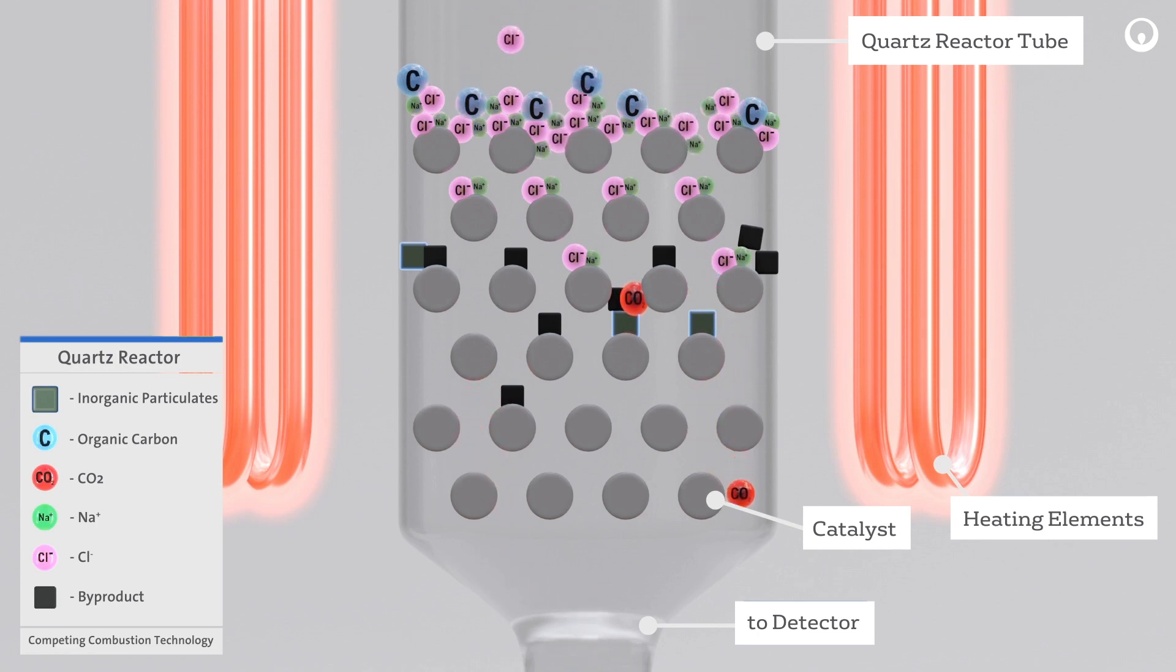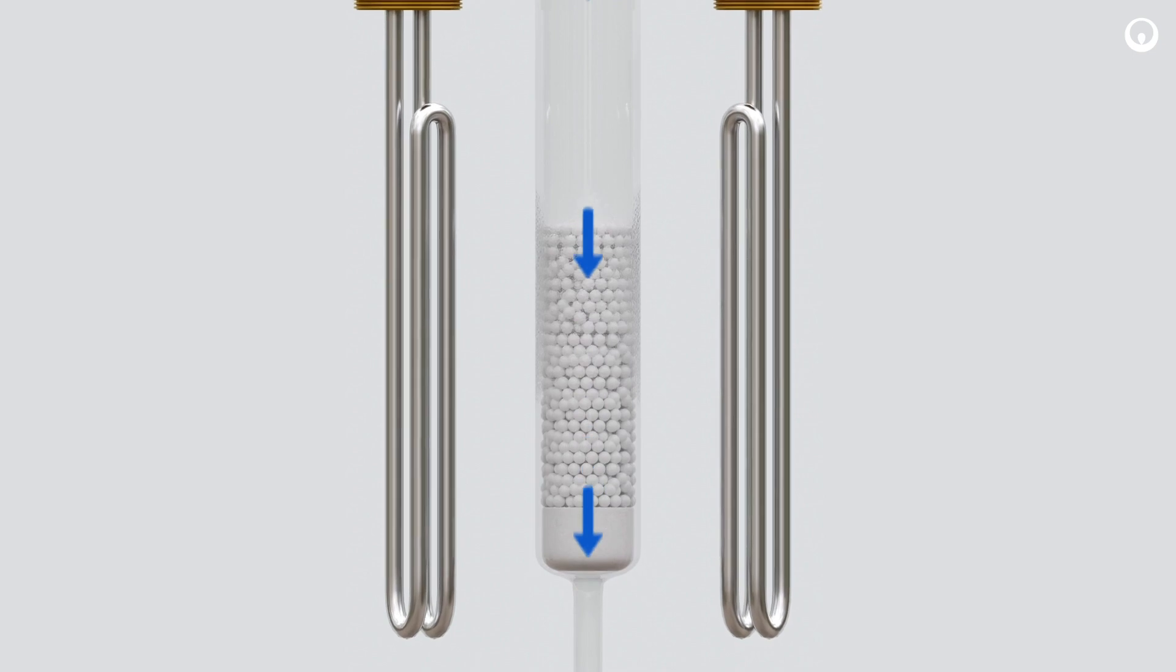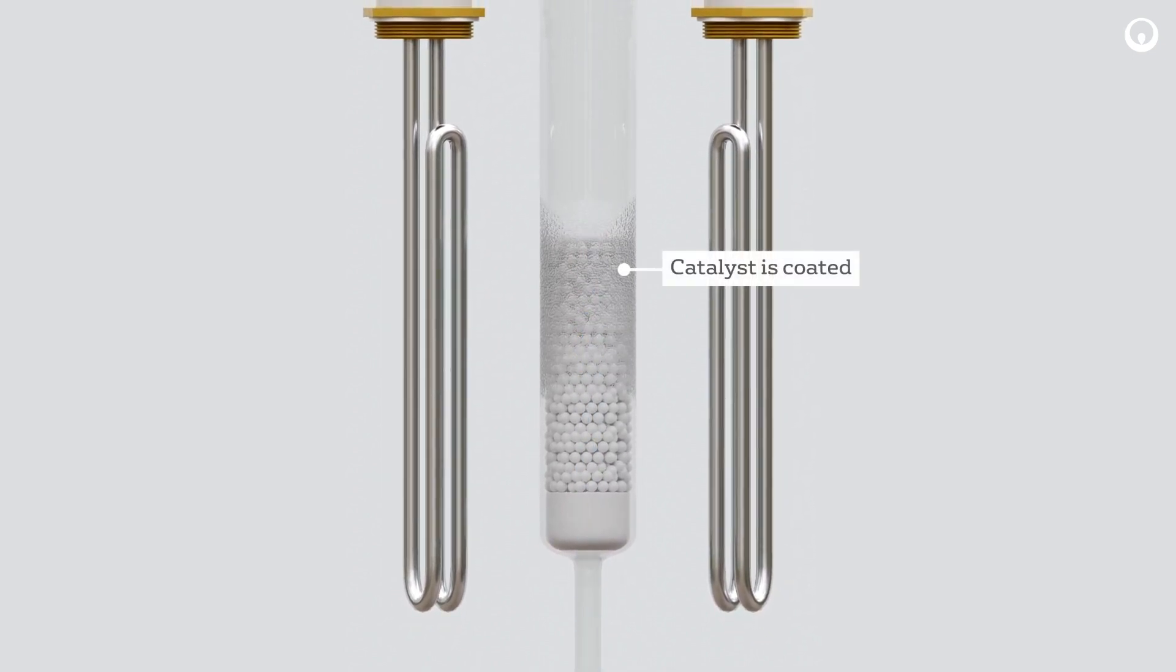The salts begin to attack the quartz reactor and cause de-vitrification, which will ultimately cause the reactor tube to crack. The remaining particulates and combustion byproducts will begin to restrict the gas flow path and coat the catalyst. When the catalyst is partially coated, the efficiency to oxidize the sample is severely reduced and recalibration is necessary.